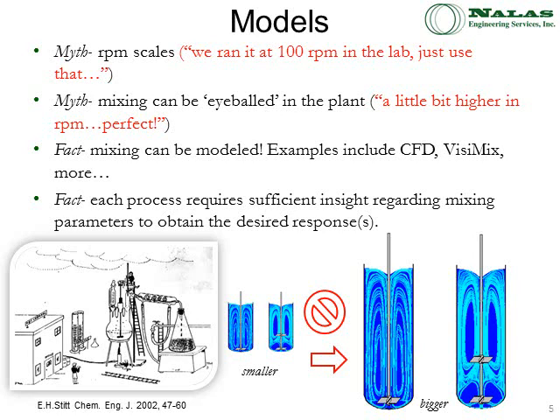You can look at a round bottom flask, you can look at the Optimax system, you can look at a production piece of equipment. What we're looking at is how to develop a model that will tell you what you're getting in the lab, or at the Optimax scale, also in the lab, will actually translate into success in the plant.